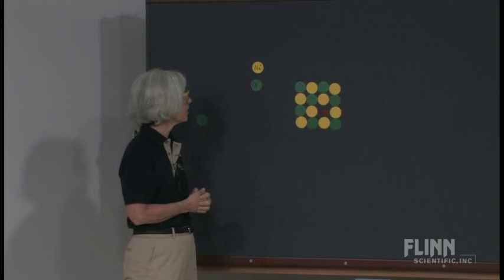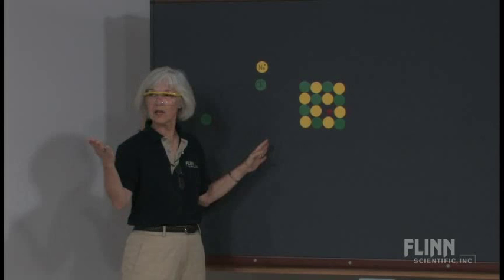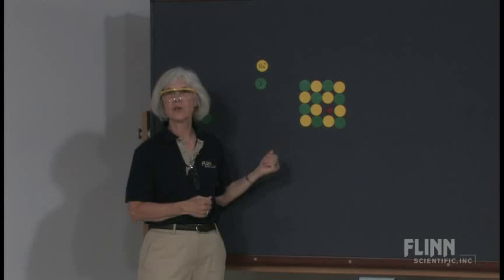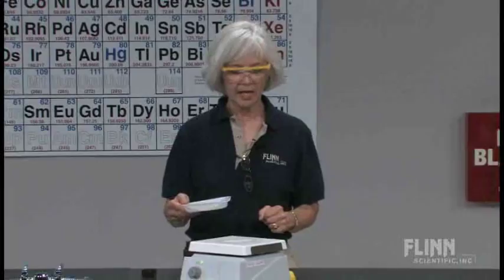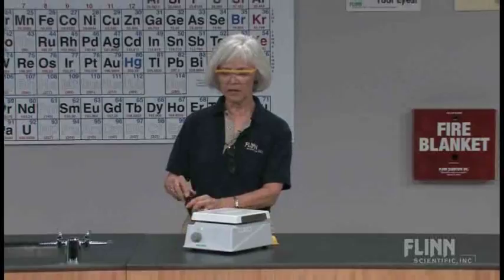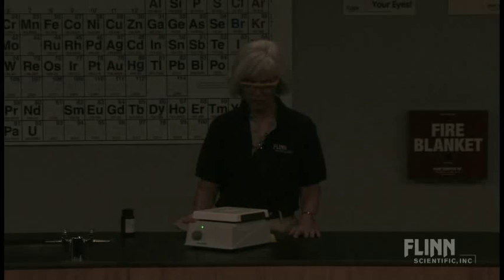It'll stay that way for quite some time. As you can see, I just dumped it out of the bottle here and it's this brownish orange color. But what happens if you apply some heat to this? That's what we're going to do with the hot plate. I'm going to take and sprinkle this on the hot plate, and we're going to have to dim the lights down to a very low light source here.